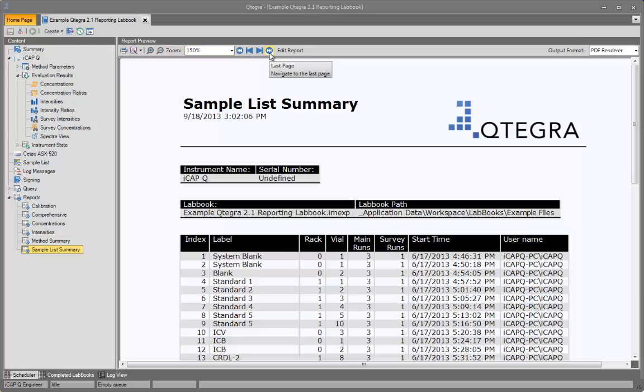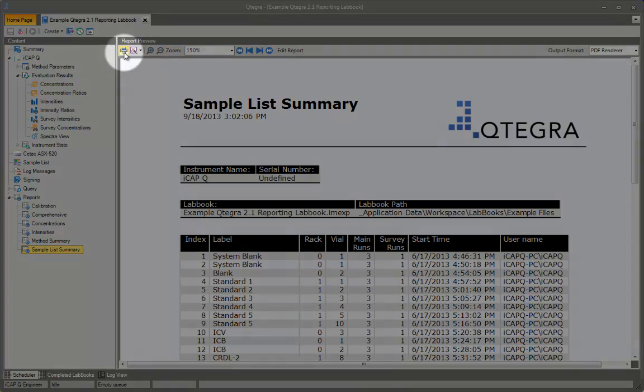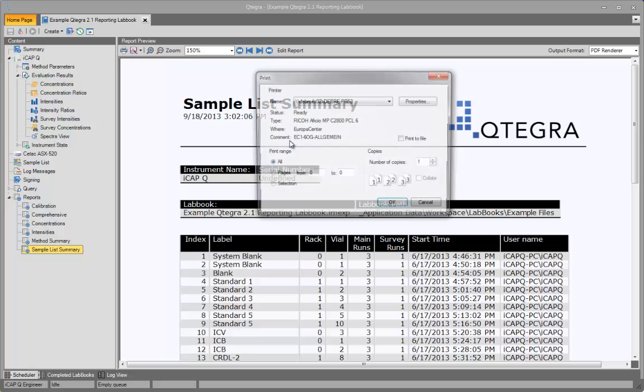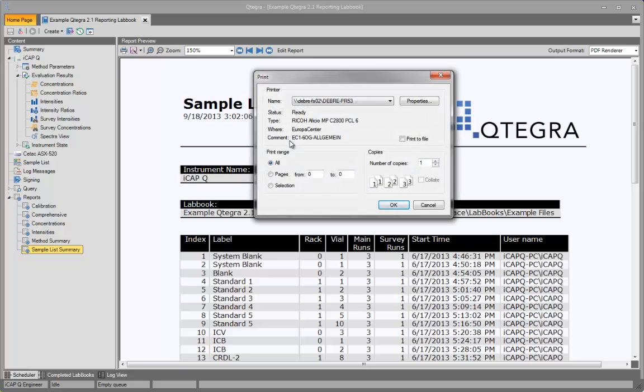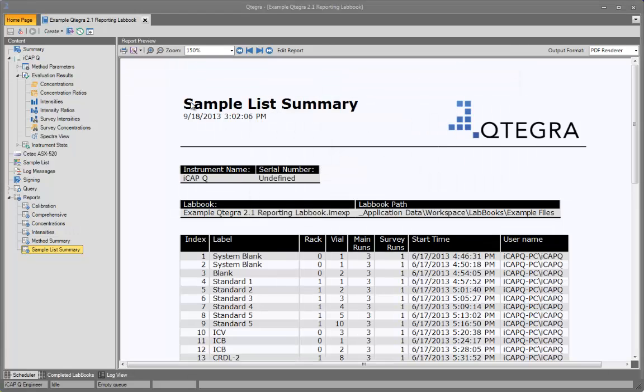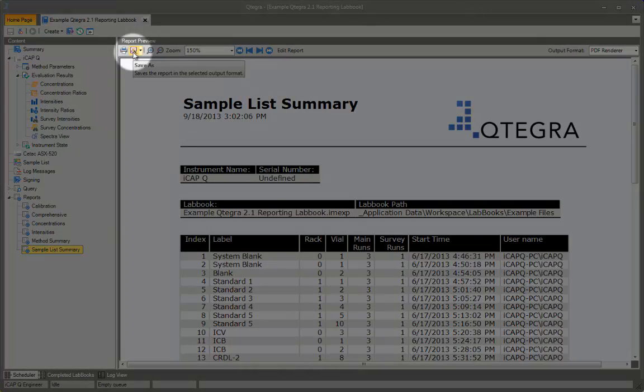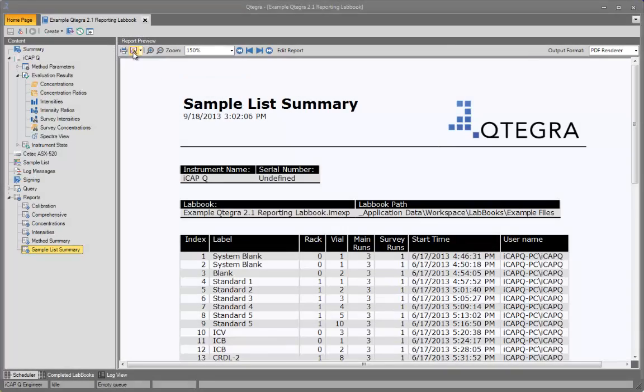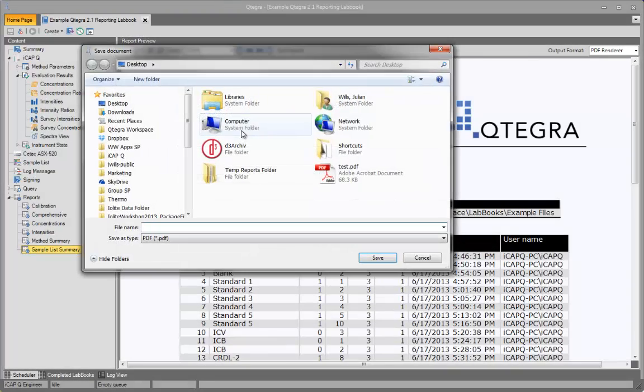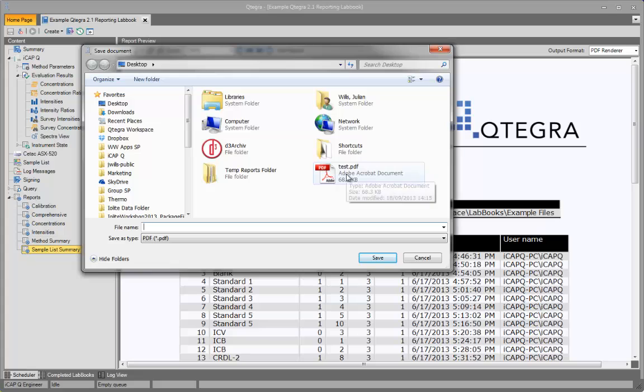The report can be printed from the print button, which takes you to the standard Windows print control dialog. Alternatively, the report can be saved by clicking on the Save button. If you click directly on the Save button, you are taken to the standard Windows save control.